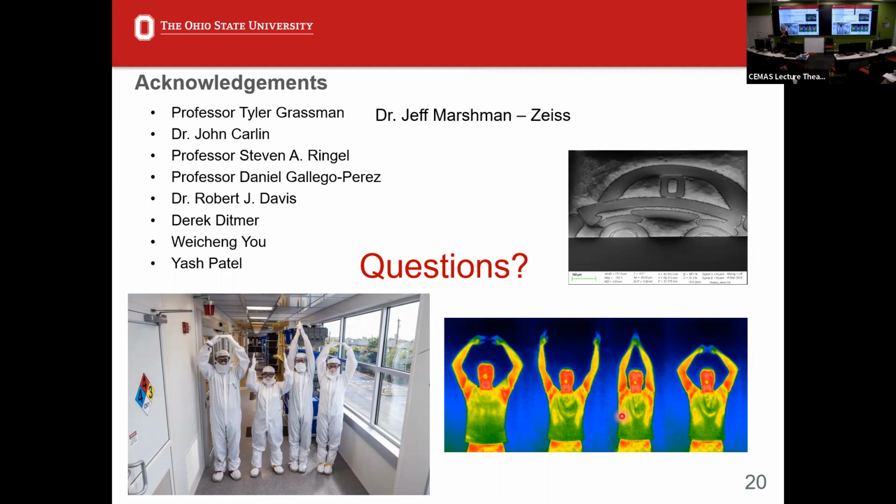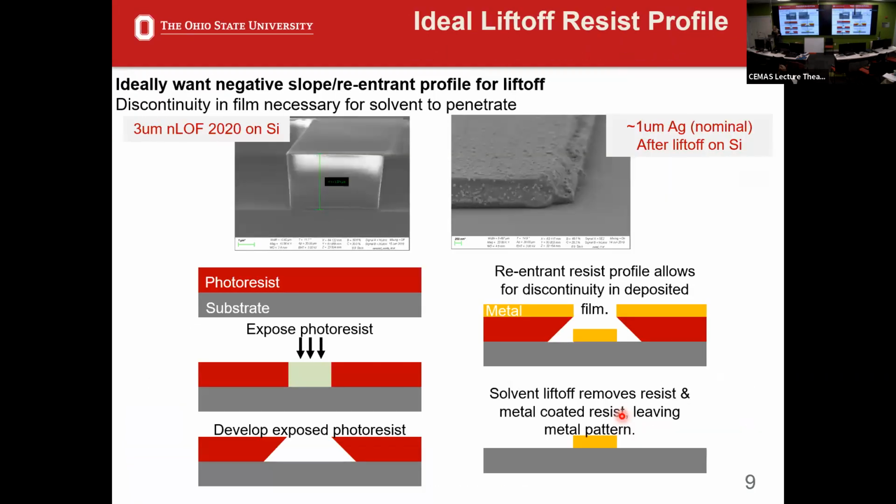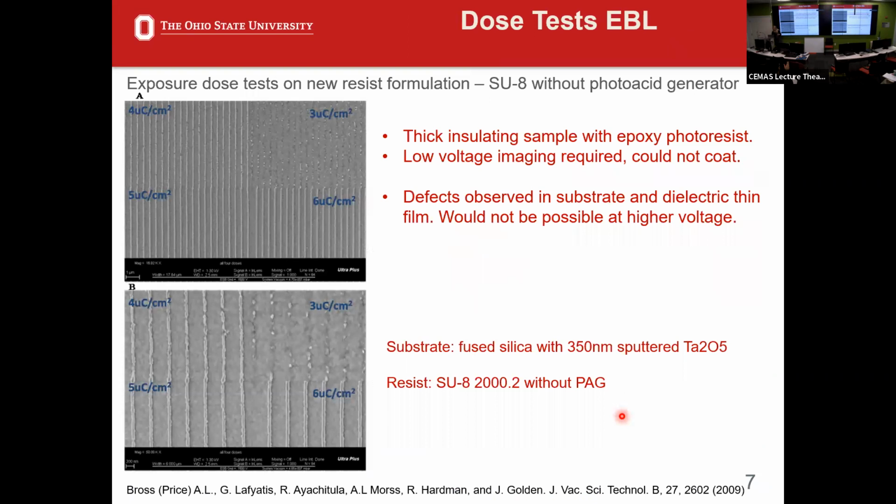Aimee, I have a question. In slide 7, you showed the SU8 photoresist pattern, where you are planning to use the grating couplers. I'm just curious, after you develop, then you do the SEM, is it damaging the resist in any way or not? Because after that you are etching it or doing the lithography to define the grating couplers. So the question was, once you're imaging it, are you damaging the resist in any way?